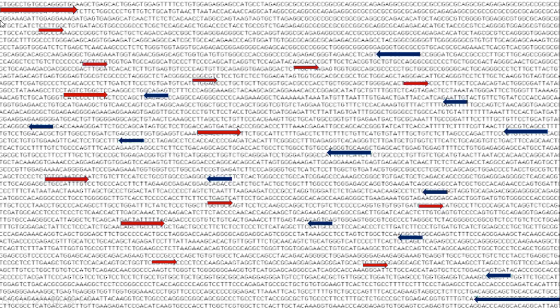So now you have different lengths. One is highly specific, with complementarity forward and reverse, typical PCR. That is good enough to go for PCR given the typical length.